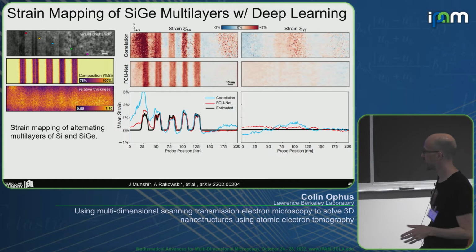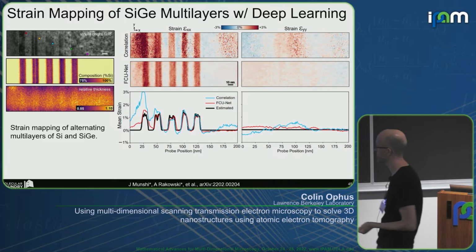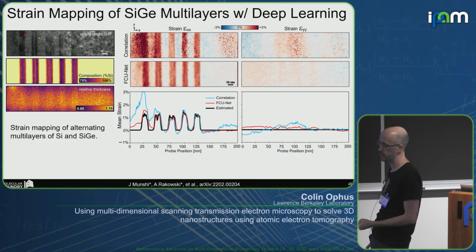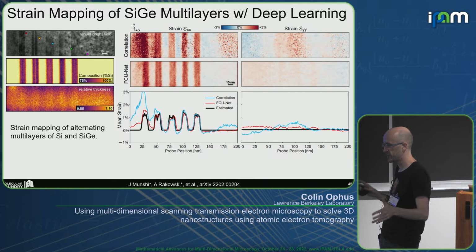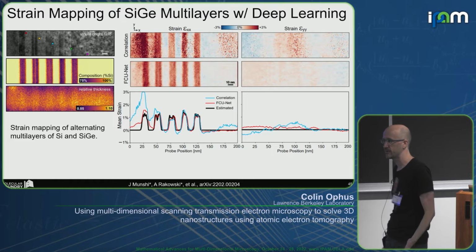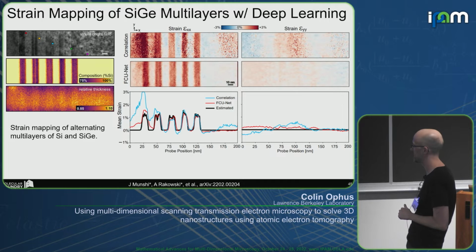And this result's actually already out of date because we routinely retrain this network too, adding more data, more parameter space, et cetera, to continually improve the results. And I should also mention, my group does not believe in software that can't be used by everybody in the literature. So if you use our py4DSTEM code and you just, instead of calling disk detection, you call disk detection_MLAI, it will download the network weights and then directly apply them to the data. So we're trying to make it as easy as possible in our Python distributions here for other users to get their hands on this data.